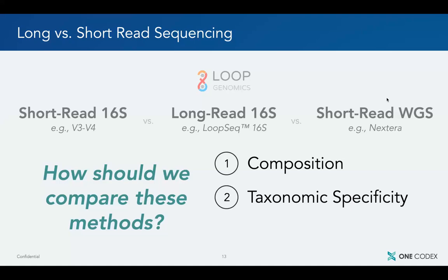You may know that they are Bacillus species, or Bacteroides, or Bifidobacterium even, but you don't know that it's Bifidobacterium animalis, for instance, because that variable region is conserved across those different Bifidobacterium, and so we don't have the information content to make an inference there.